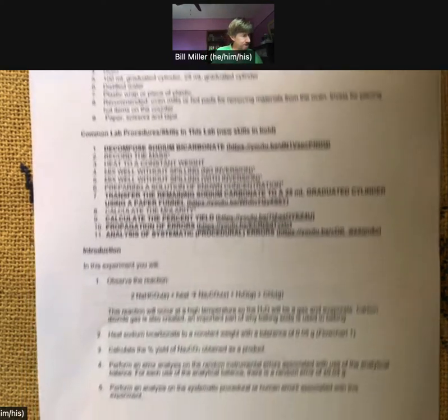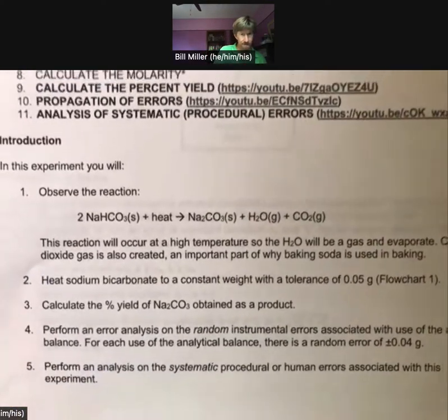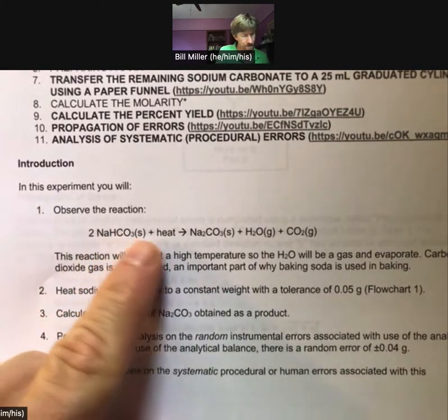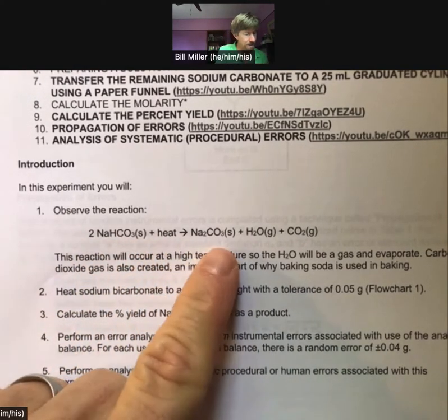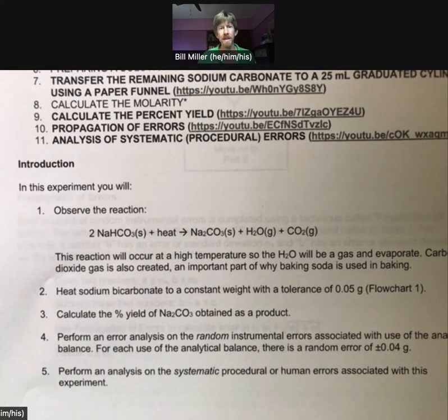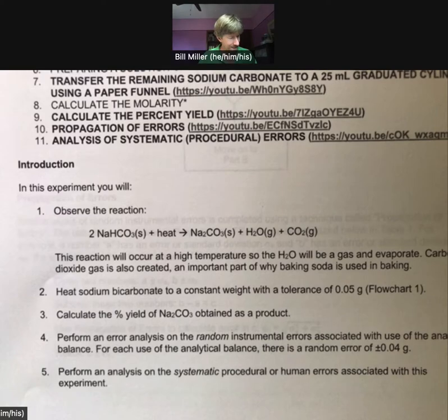And the reaction that's happening here is going to be on the first page of your lab. It shows you sodium bicarbonate, two of them with heat that we're putting in will turn into sodium carbonate plus H2O plus CO2. That H2O, which could be liquid or gas, since we're above 100 degrees Celsius, it will be gas, and that's why it's got the gas designation there.